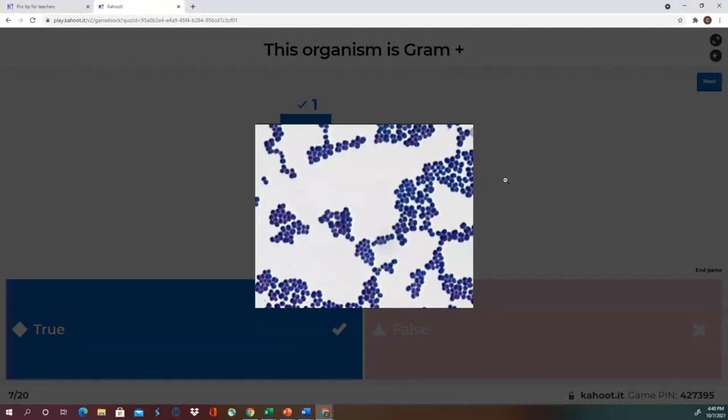You have to look and see collectively what's going on. Okay, and we normally see them all in clusters. There is a little diplo over here, but look at all of these staphylos, right? Mostly they're all in nice, pretty clumps. Yes, you have to look collectively to see what's going on. But you have to make sure that your specimen doesn't just have way too many cells, because then everything looks staphylo even though it's not.